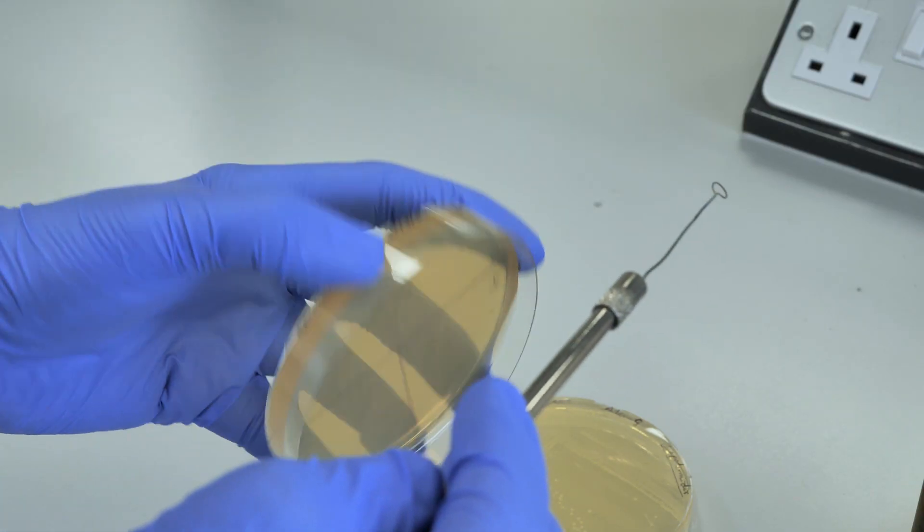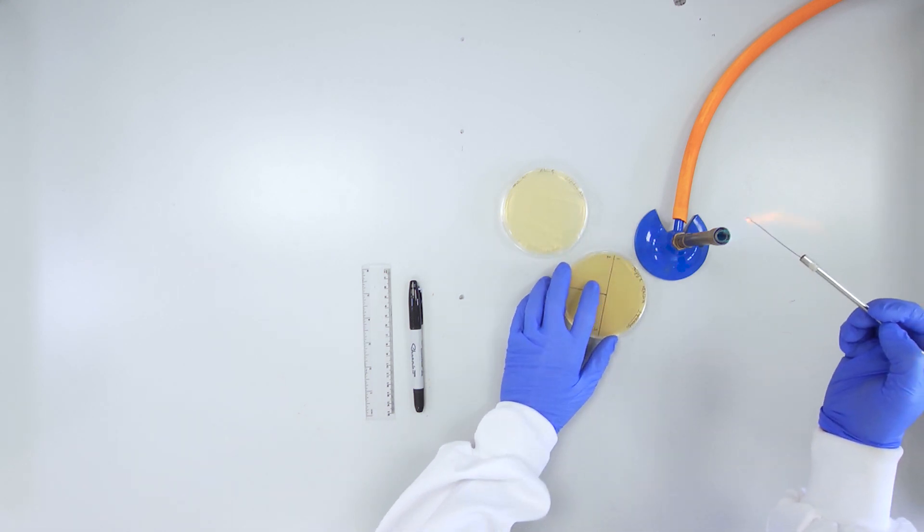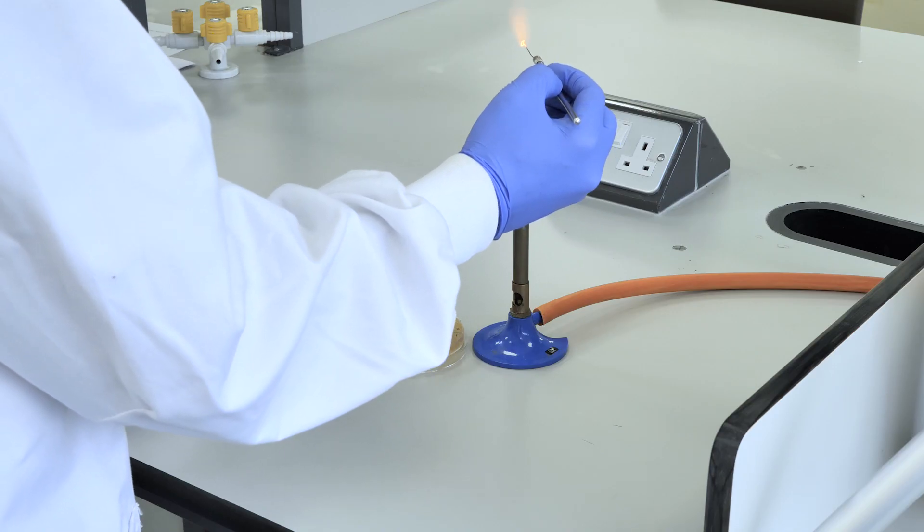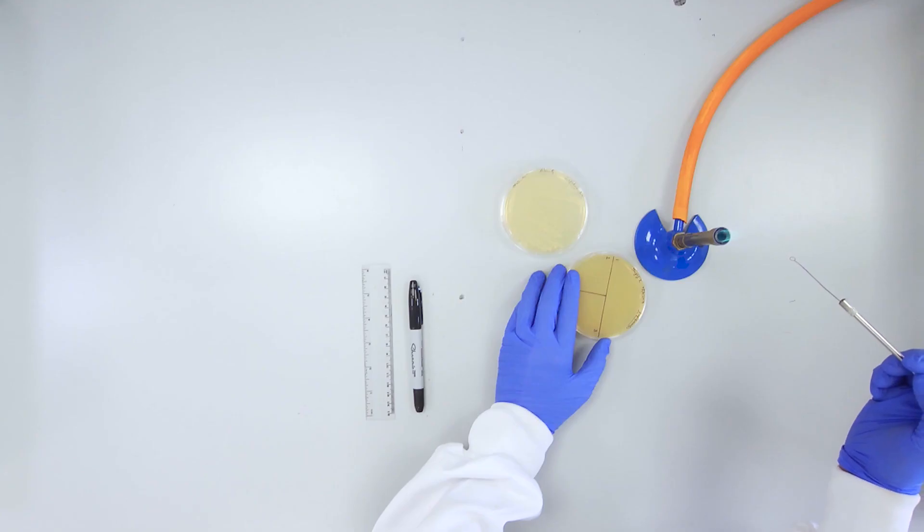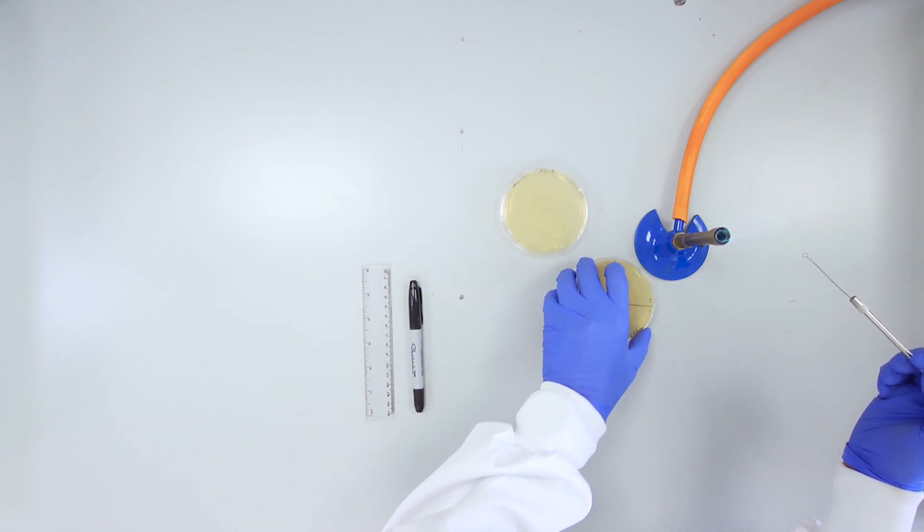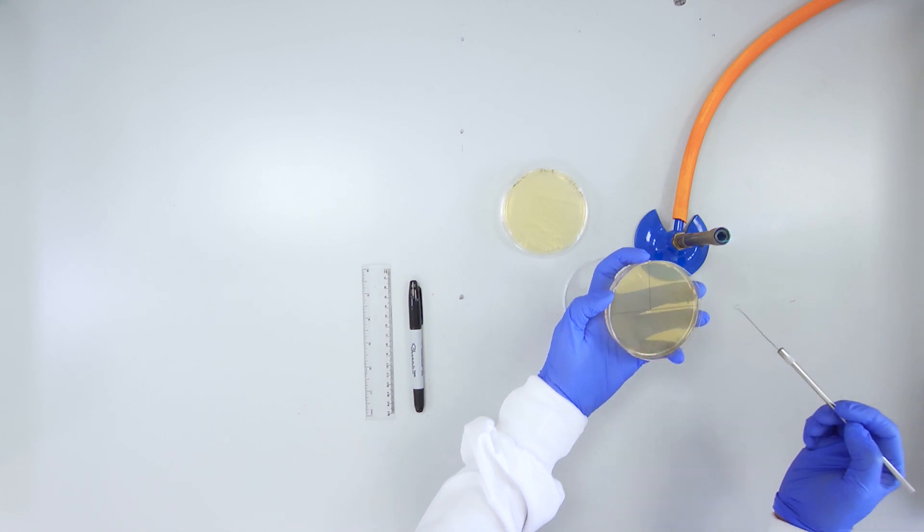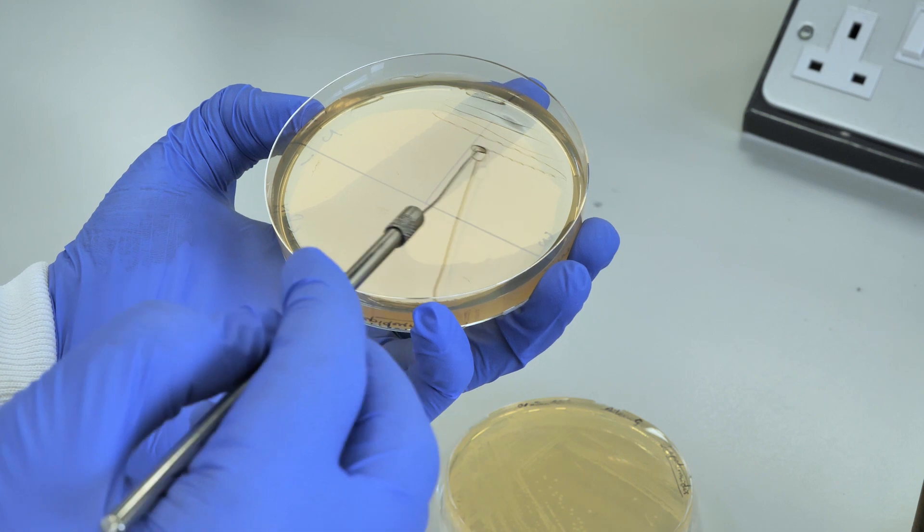Again, replace the plate immediately afterwards. Re-sterilize your loop and allow to cool for 20 seconds. Rotate your TSA plate a further 90 degrees to the right and recharge your loop by going back into section 2 and streaking into section 3.